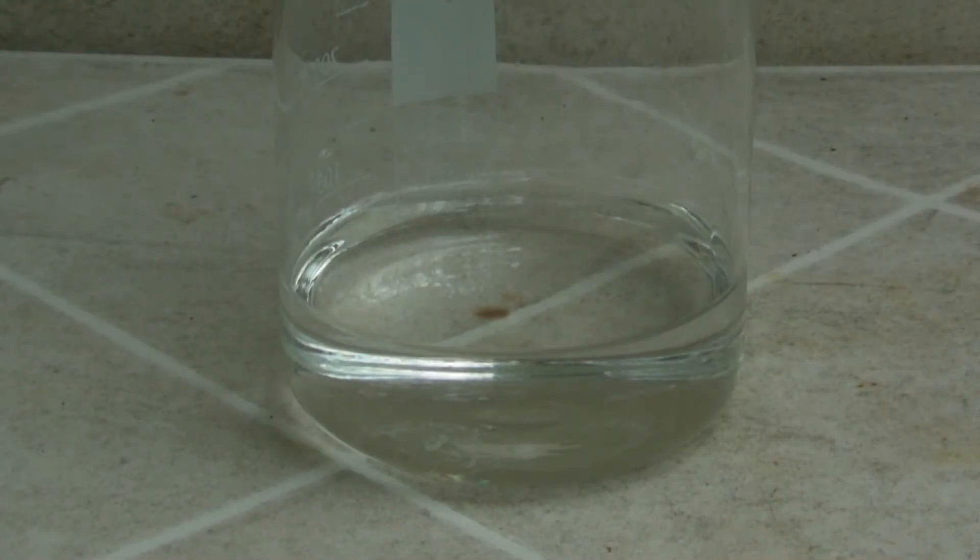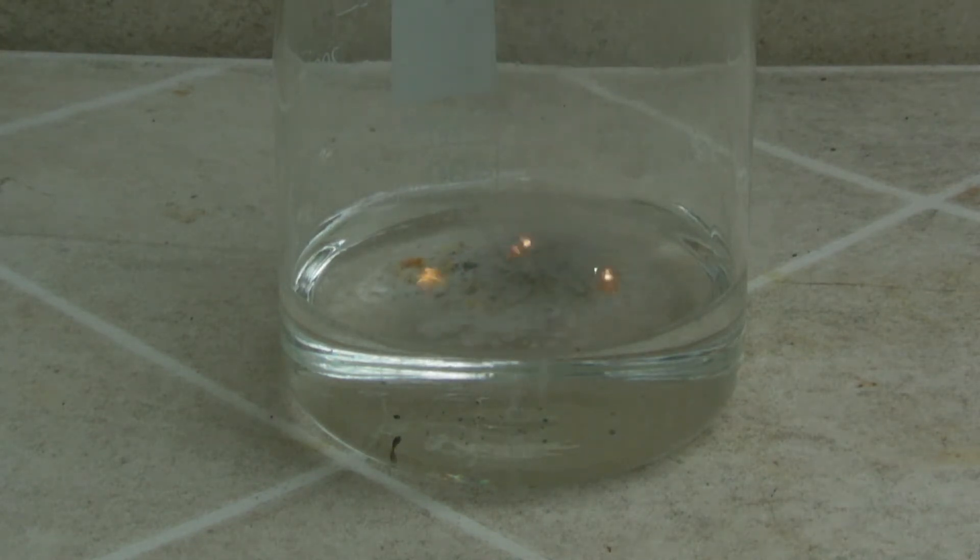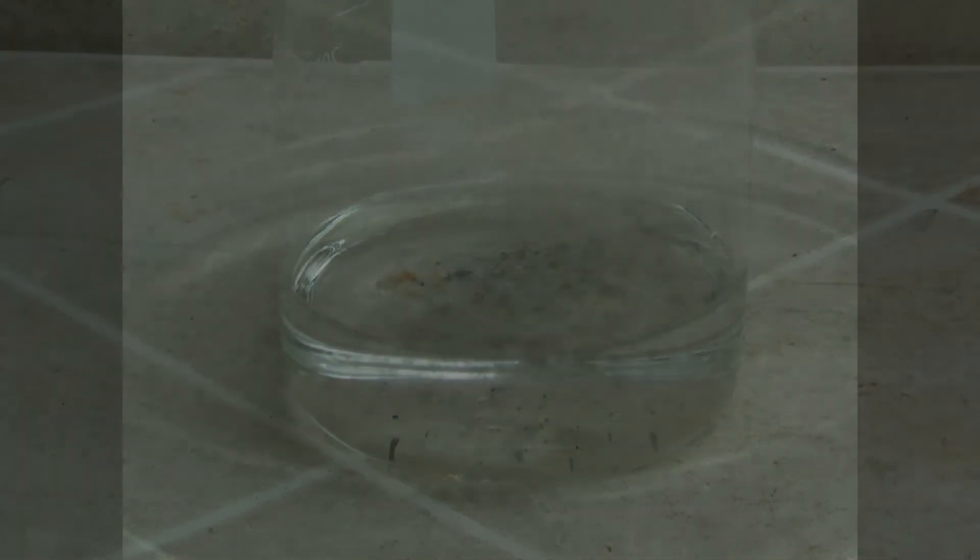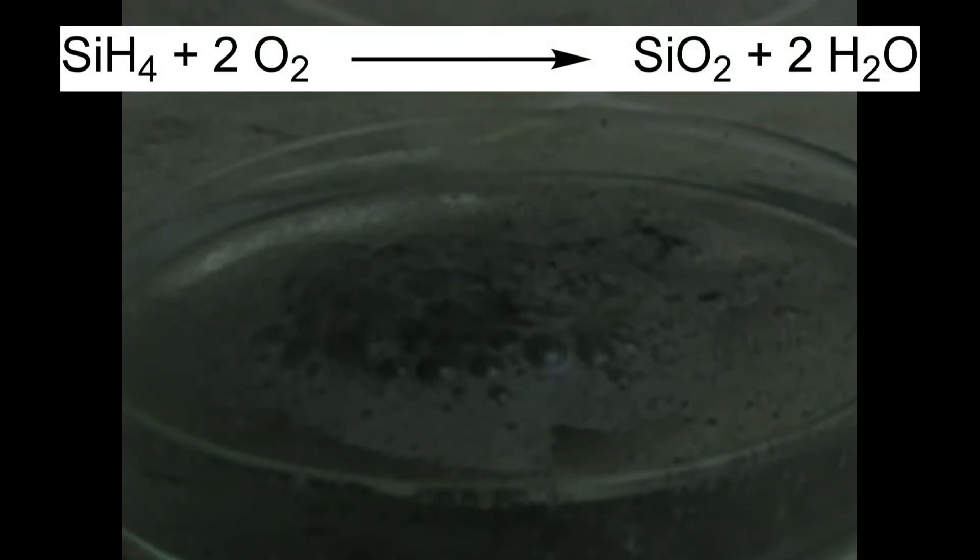Then a part of the magnesium silicide is added to 10% hydrochloric acid. The magnesium silicide reacts with the hydrochloric acid to form monosilane and magnesium chloride. The monosilane is pyrophoric and reacts with the air to form silicon dioxide and water in an exothermic reaction.